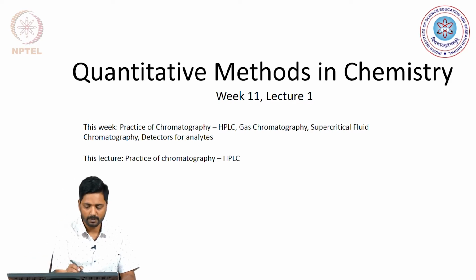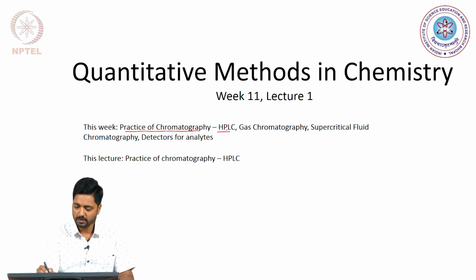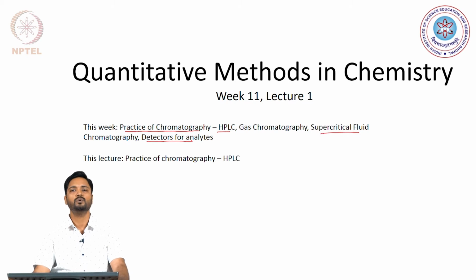We will be talking about the practice of chromatography in terms of how HPLC is performed, what gas chromatography is, its principles and practice, and we will also get introduced to a very interesting form of chromatography which utilizes supercritical fluids as the mobile phase. Our understanding will also be developed in terms of what detectors are used to detect the analytes that are eluting out of these chromatographic columns.